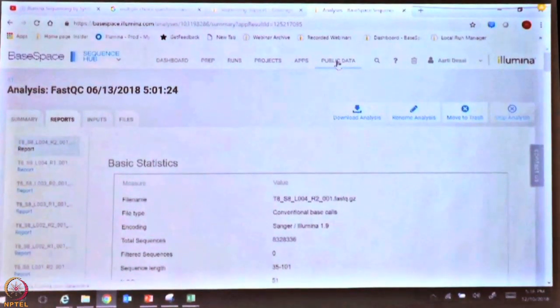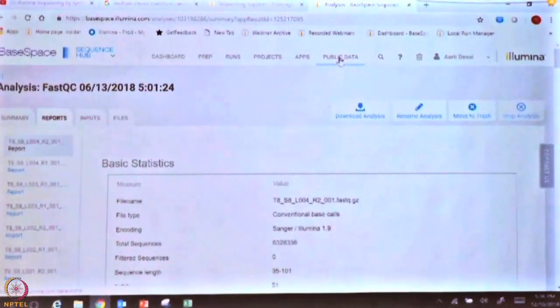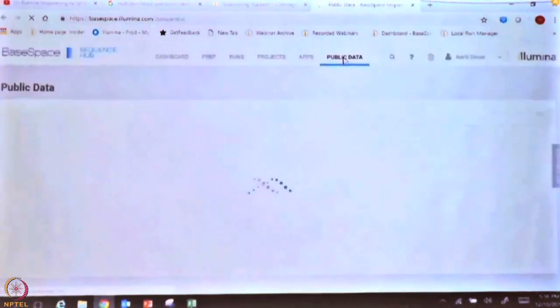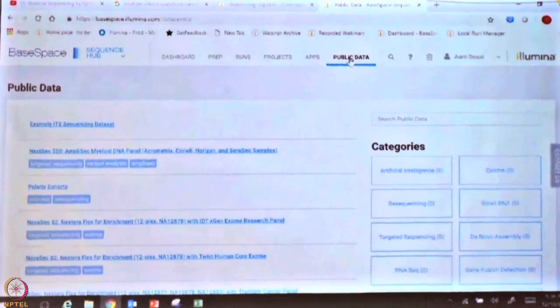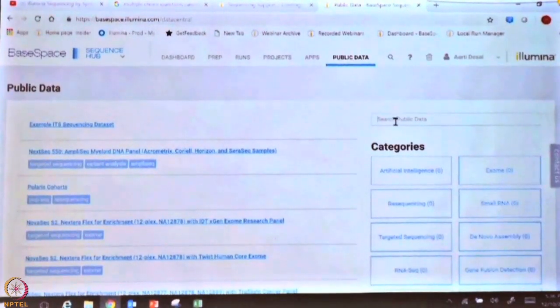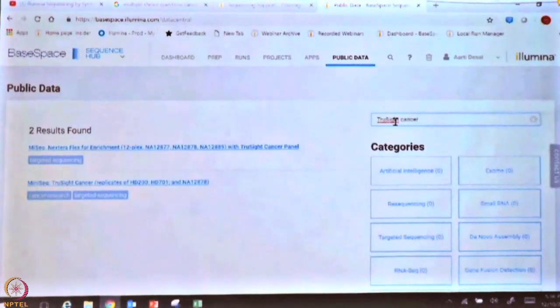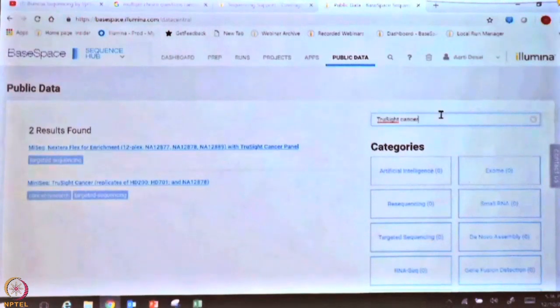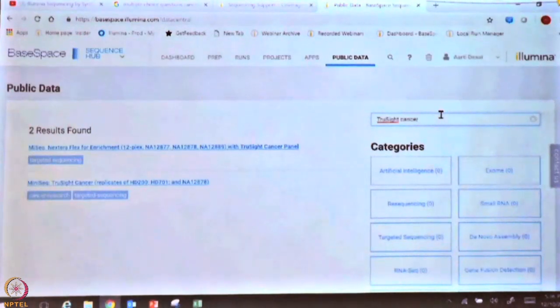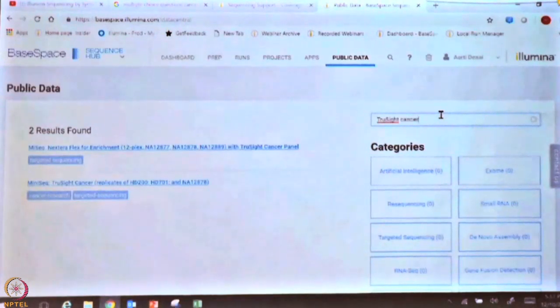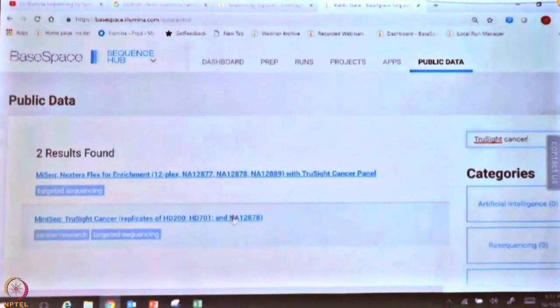Once you are in your account and logged in to BaseSpace, go to public data and search for 'TruSight Cancer' — spelled T-R-U-S-I-G-H-T Cancer. Then click on the second project, which is the MiniSeq TruSight Cancer project.